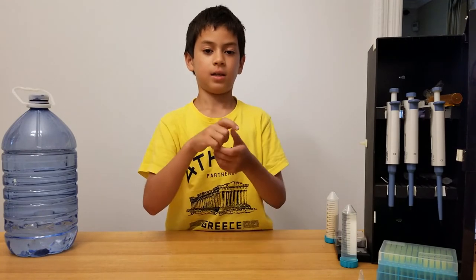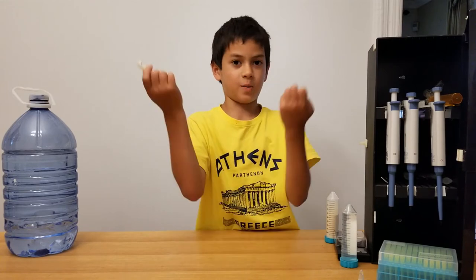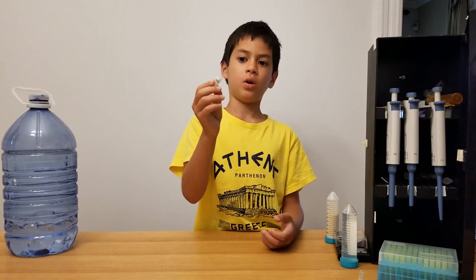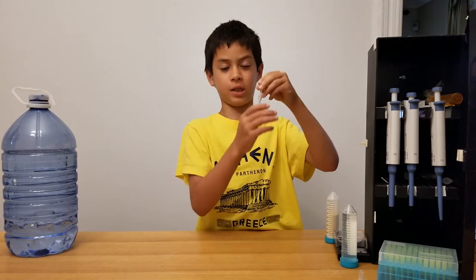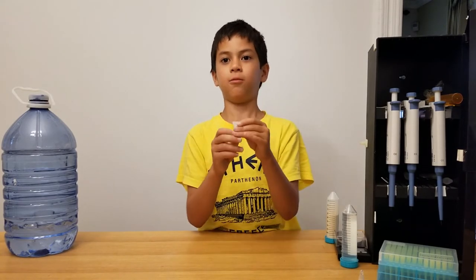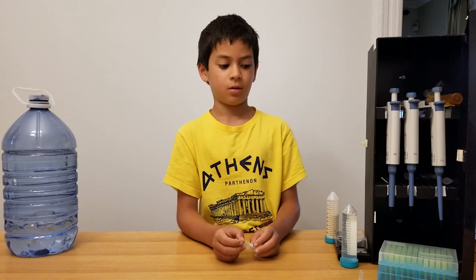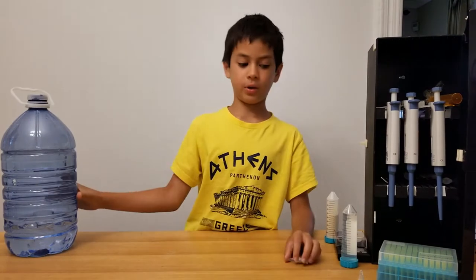The final thing we're gonna use is a poison to kill anything inside the petri dish that is not the bacteria we're using. If you're just putting random bacteria inside, you don't need this. But if you're targeting a specific bacteria, you'll use this. We're using a specific type because our bacteria is resistant to it — it's called kanamycin. All you have to do is research your bacteria and see what poison it's immune to.